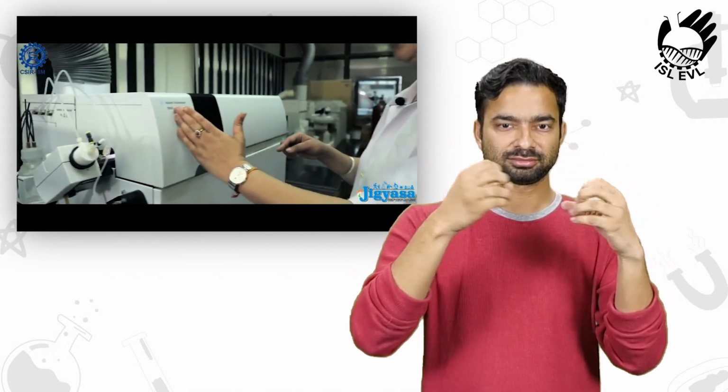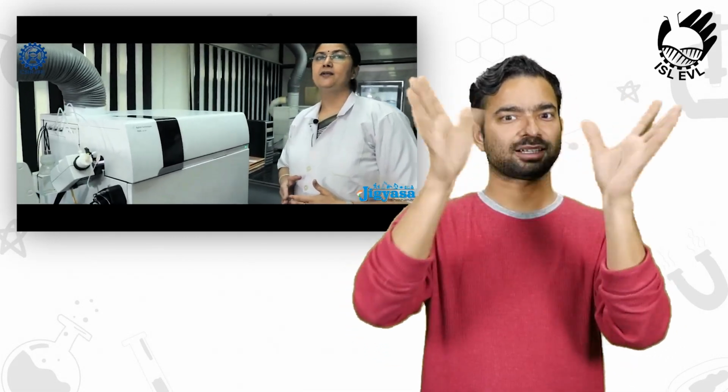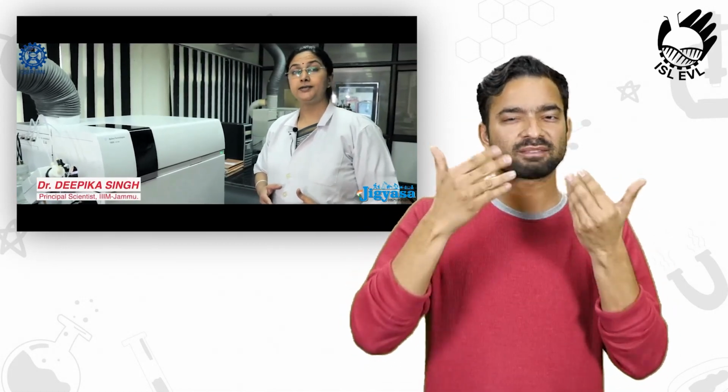The torch is in contact with plasma where the sample is being heated. Thereafter, it is coming into a vacuum with the mass analyzer and converted into ions. And we are seeing the elements arsenic, lead, cadmium and mercury, which are very toxic heavy metals, unsafe for drinking. Water should be free from these heavy metals.